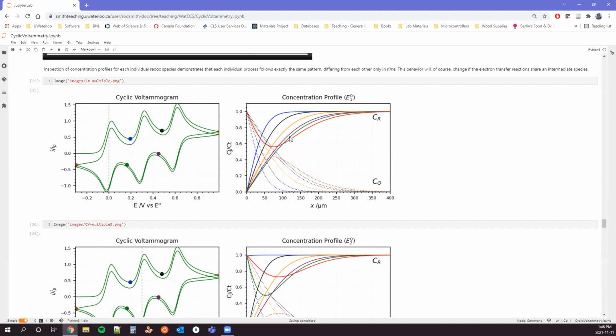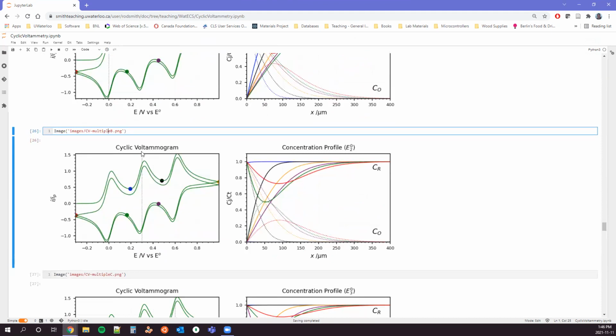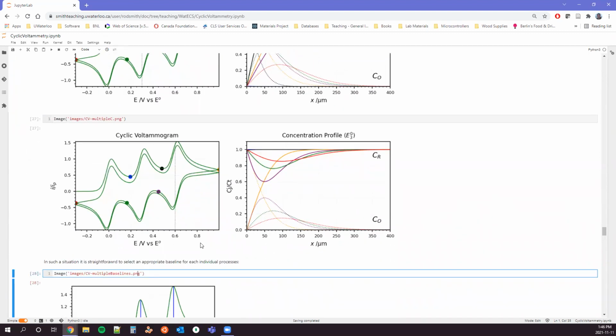When we get back to the orange, we've reversed it. And now, with the red, we're starting to get this bulge in solution. I've got my labels reversed again, sorry. No, I don't, they're right. Then the second one, we see exactly the same thing, except our potentials and our times are different. The blue and the green here are going to have that wave of concentration formed in solution. And of course, with this third potential, we're going to see the same thing. They're all showing the same behavior. They're all adding together. The only difference is mass transfer versus time.